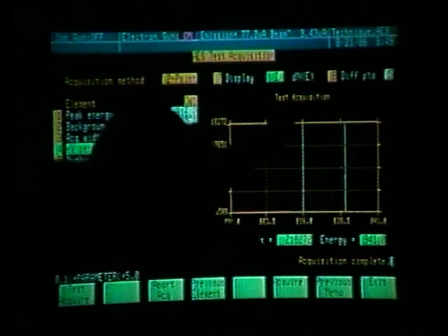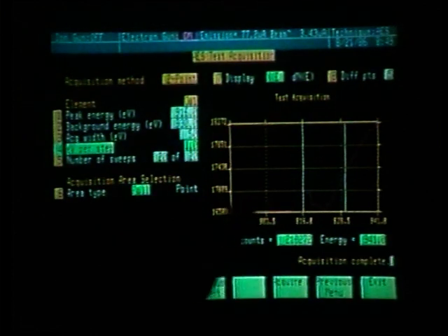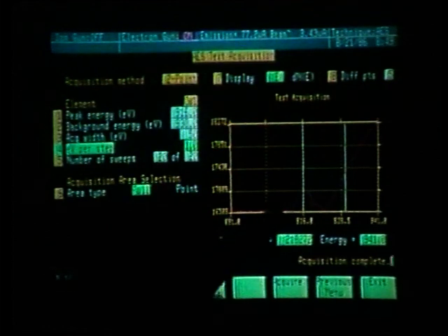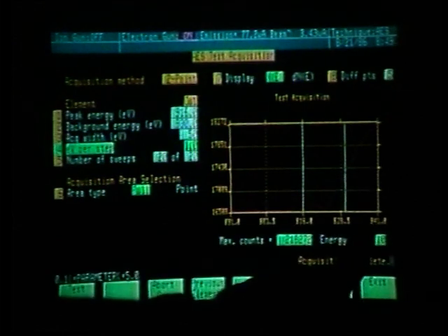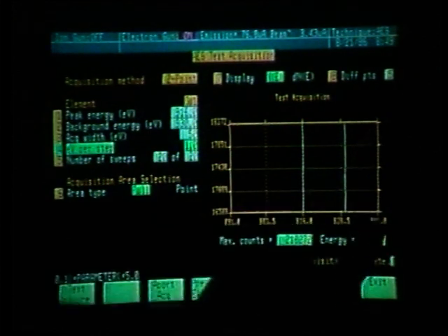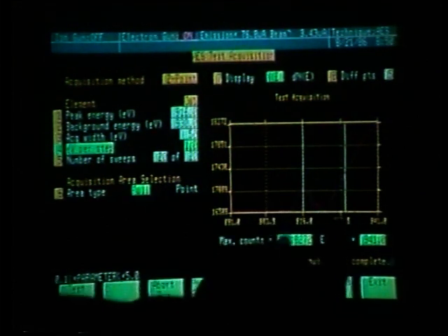We see that the peak of copper is at 916. That is the center of our copper peak. Notice that the signal is very, very small, and because of that, it has expanded full scale, bringing the far right energy, being 941, to the very top. What we need to do is probably collect this data over a smaller range.